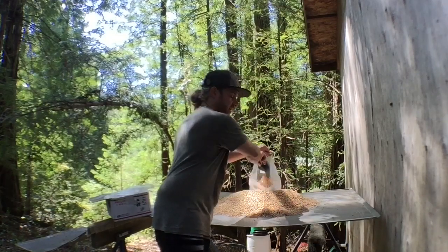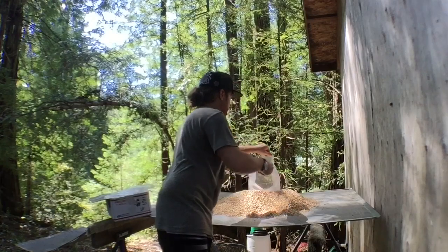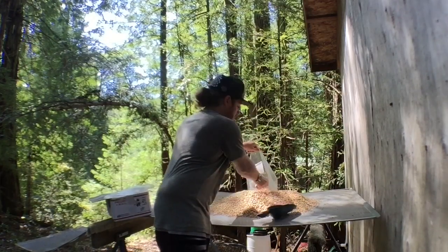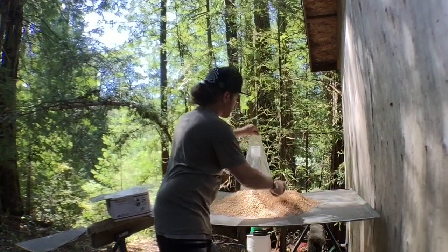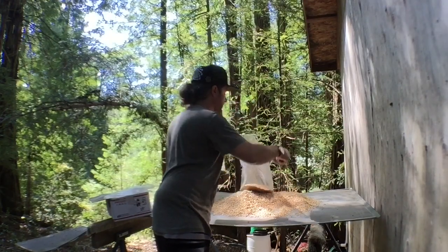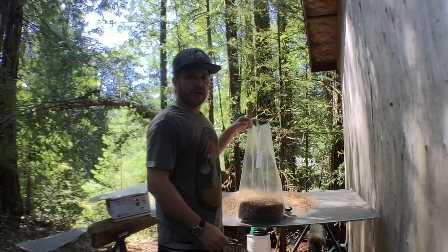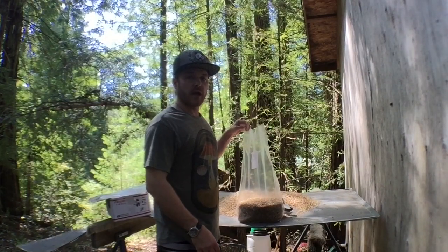And then we'll bring them in. And we will add a filter strip of breathable Tyvek. And then we'll fold them up and place them into our autoclave basket. So that's pretty good right there. We're going to do the rest of them and then we'll bring them inside and we'll show you how we fold them up.